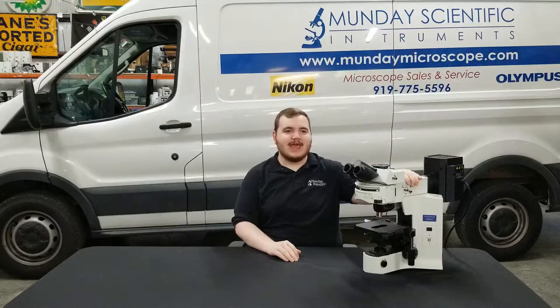Hi everybody, I'm Walker Kelley with Munday Scientific Instrument Service, and today we're going to be showing you how to remove the head and fluorescent lamp house off an Olympus fluorescent microscope.